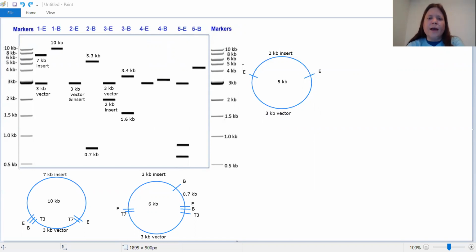We've also got our BamH1 site, which I'm putting on the left this time just because that's where the cursor was. That's as good a reason as any at this point. It really doesn't matter at this point in plasmid mapping which side you put it on, so long as it's close to an EcoR1 site and in the vector. And now we'll put in our T3 and T7 sites. There's T7 on the side that doesn't have BamH1, and T3 on the side that does.